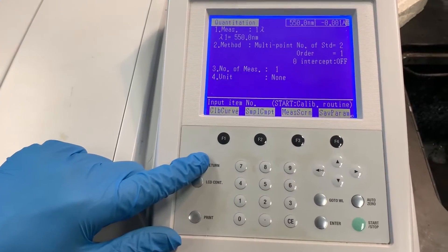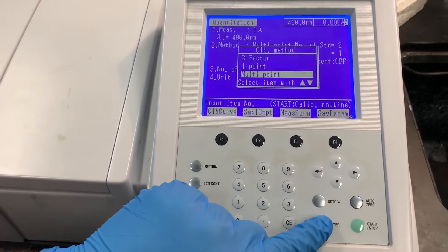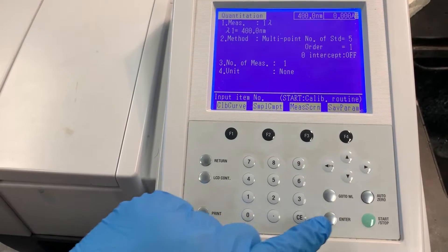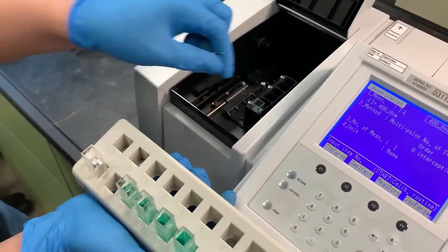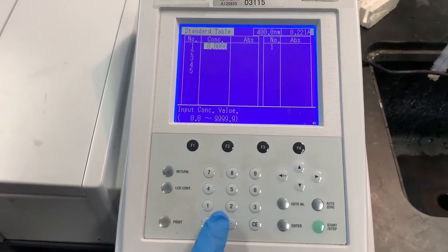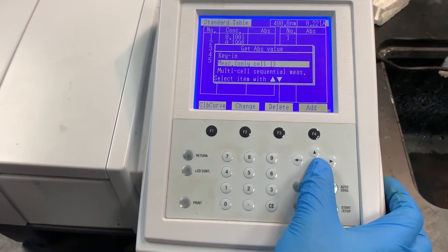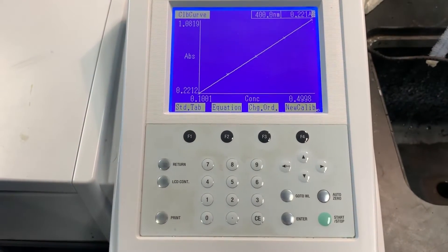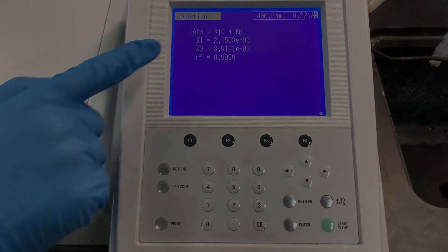Return to the previous page, select measure, enter one lambda, and adjust the required input wavelength. Now select method, multipoint, and adjust the number of standard solutions. Press enter and select zero intercept as off. Select auto zero to begin the calibration process. When the process is completed, replace the blank cuvette with the prepared cuvettes of standard solutions. Press start and input the concentration of the solution for the corresponding cuvette. Select multi-cell sequential measurement and press start. When the analysis is complete, select calibration curve to view the graph, and equation to view the equation of the graph.